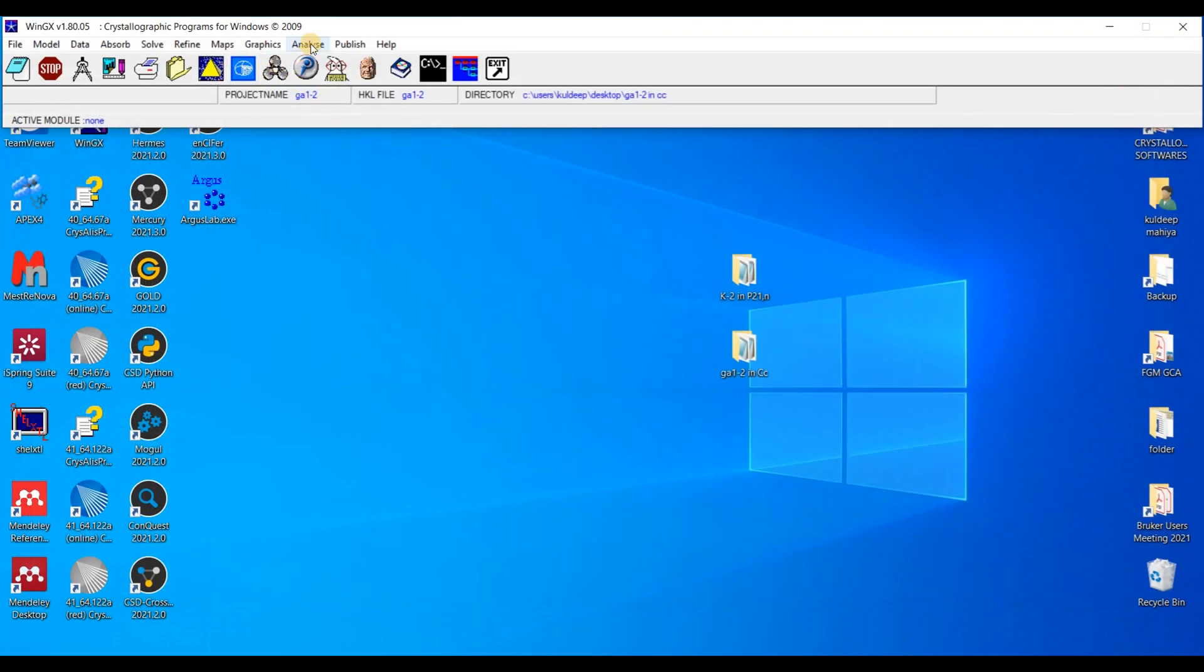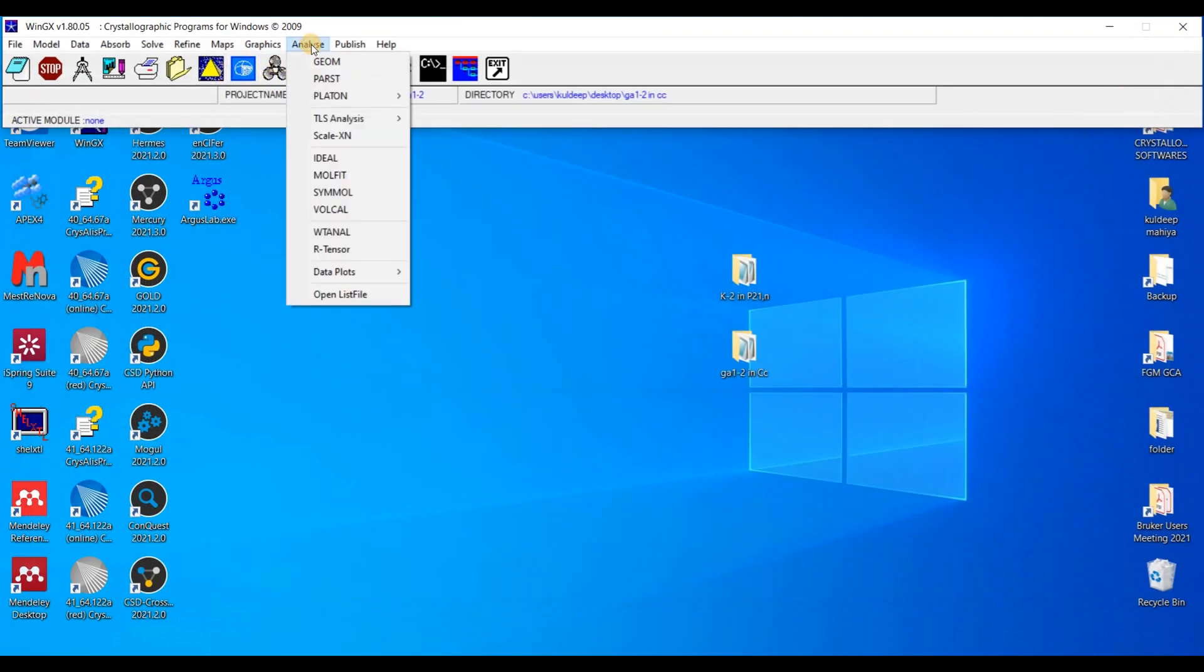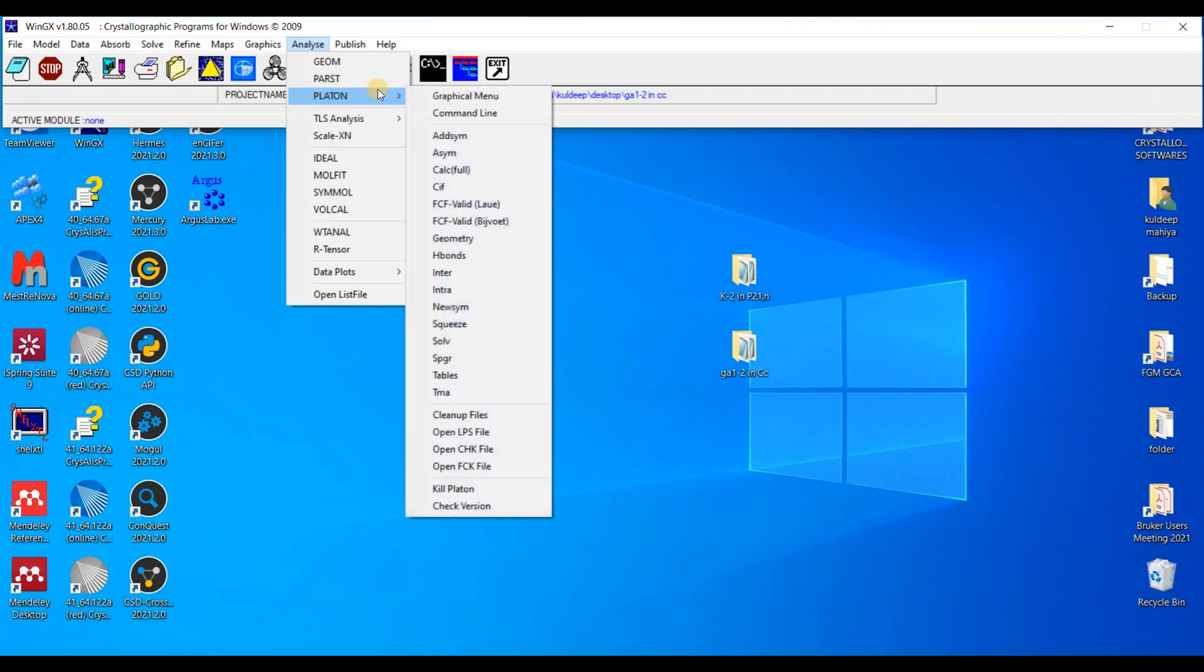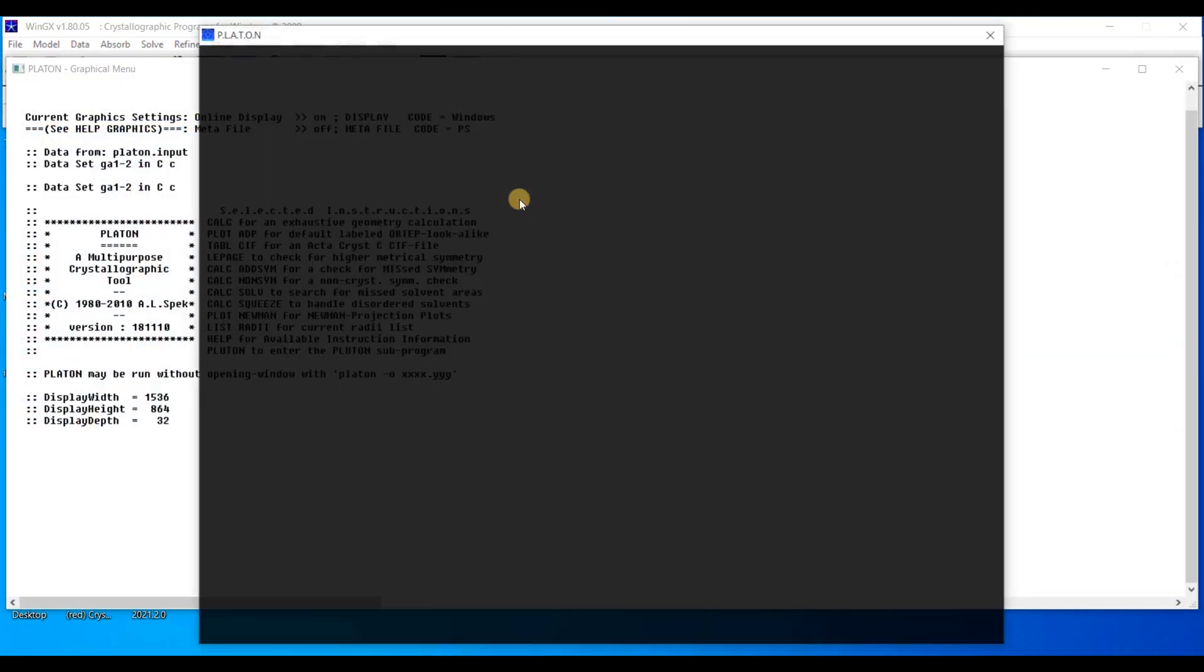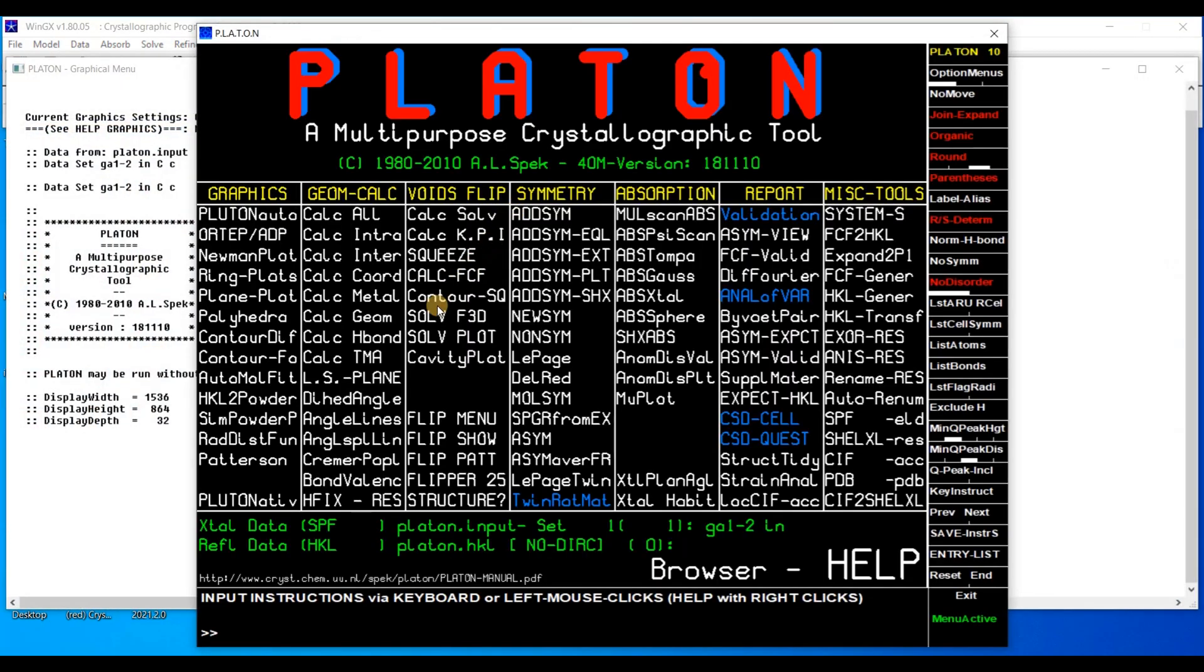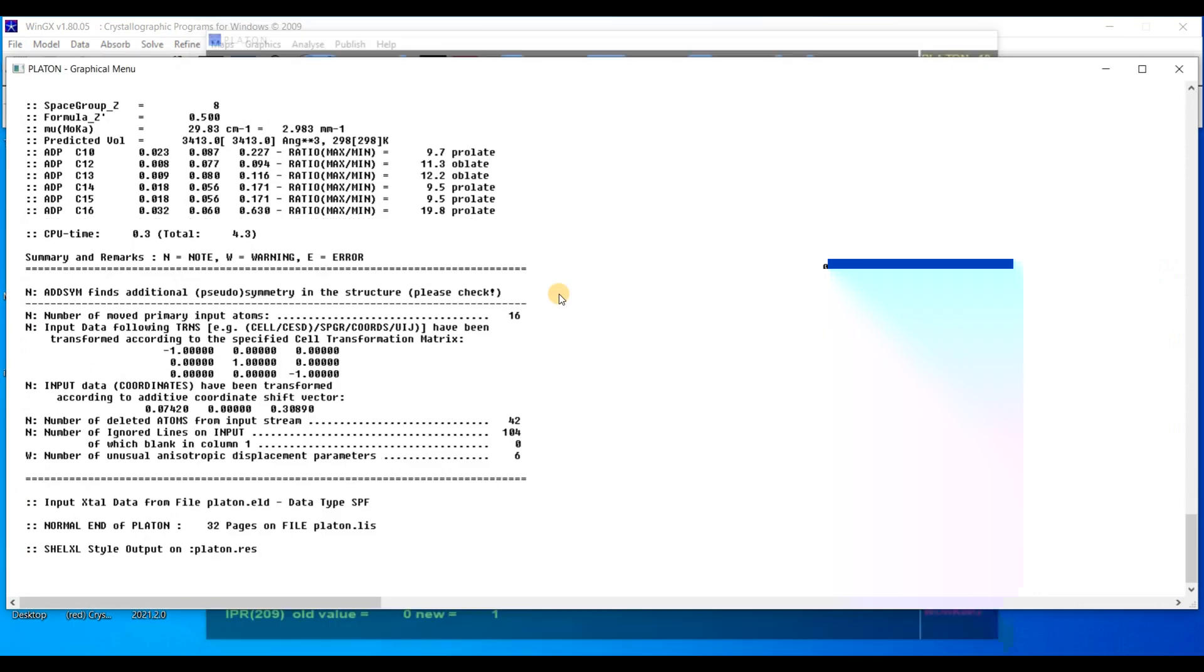Now the R factor is around 6.47%. Let's go to Analyze, Platon, Graphical menu. And again the same tab, AdSym shx. I will press it.